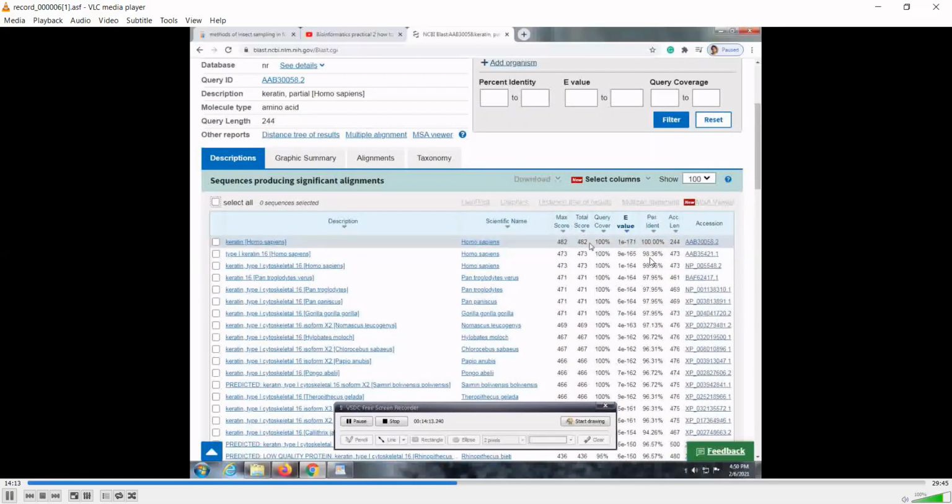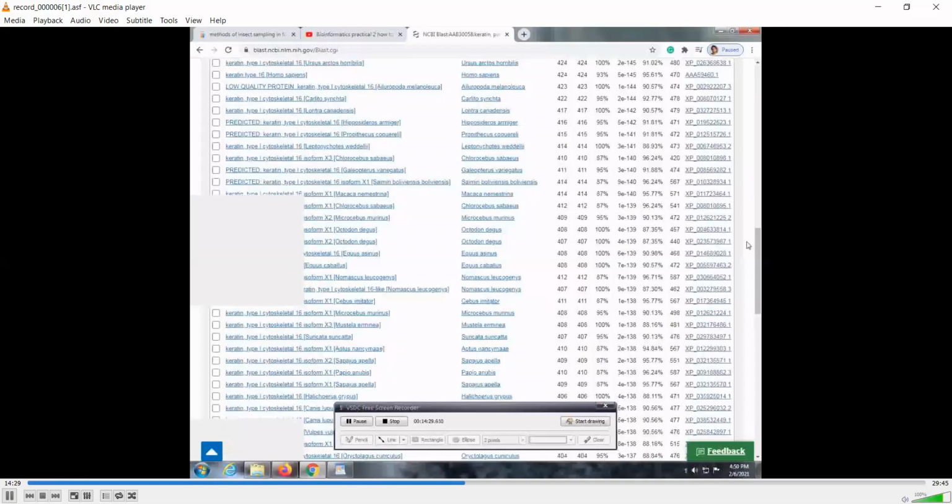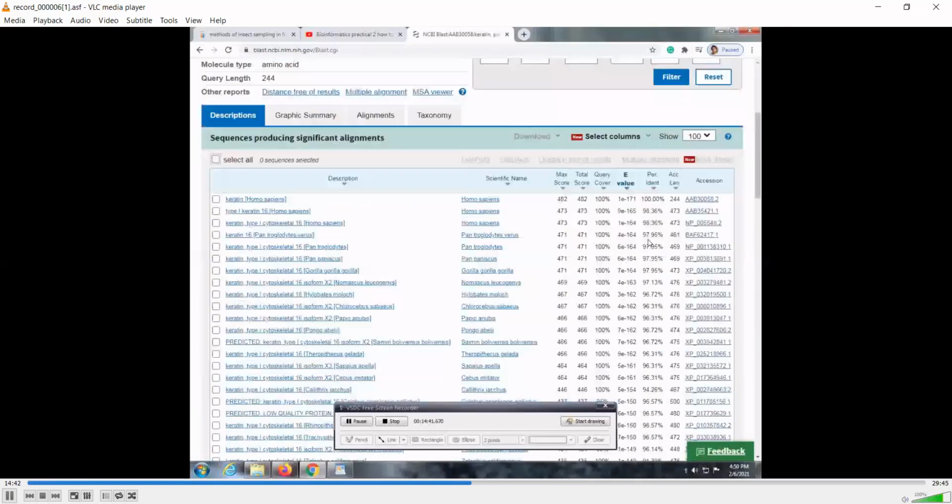It is 98.36 similar, so it's not 100% because some difference is there in the amino acid sequences. So it shows a variation. Like that, these amino acid sequences are about the same, but not exactly equal. So the list is 91, 86, and 85. And these are some similarities.